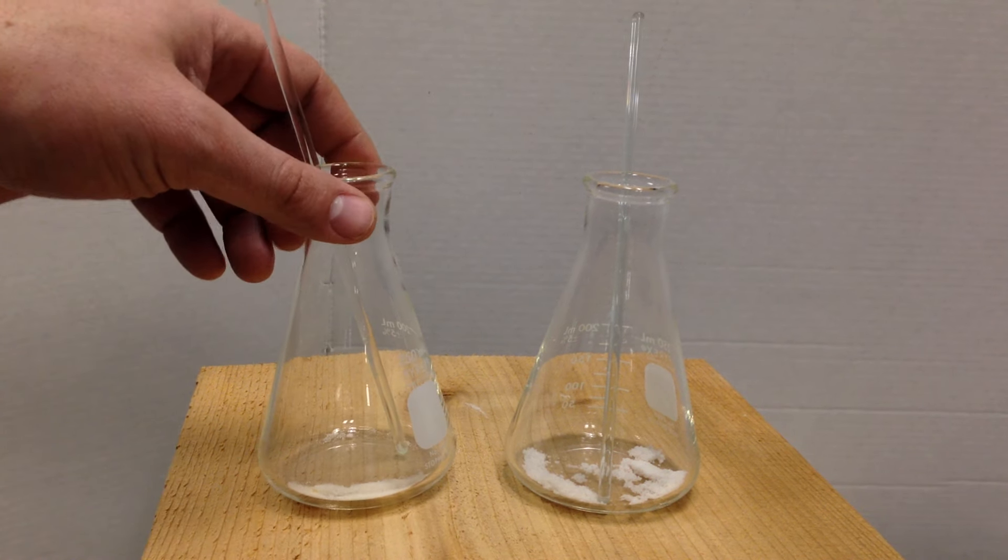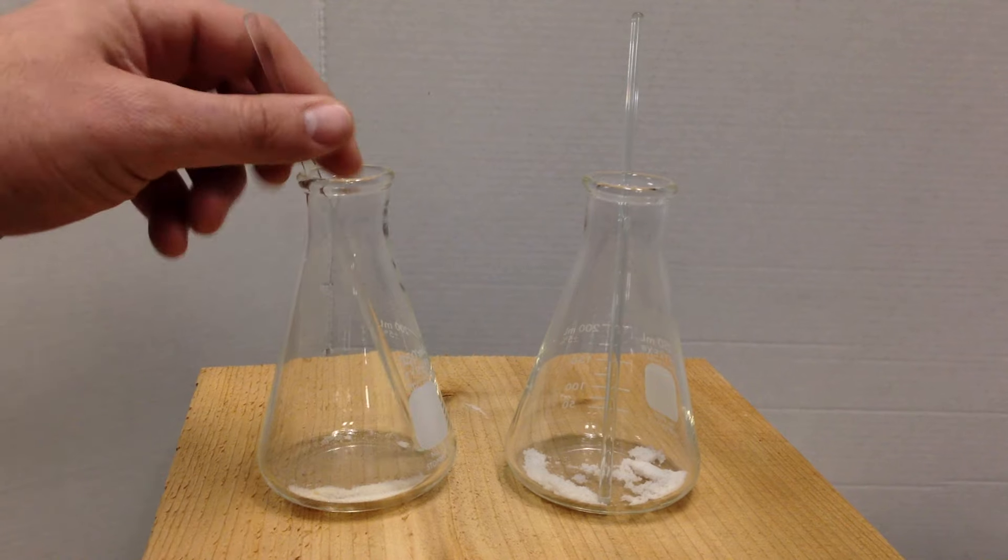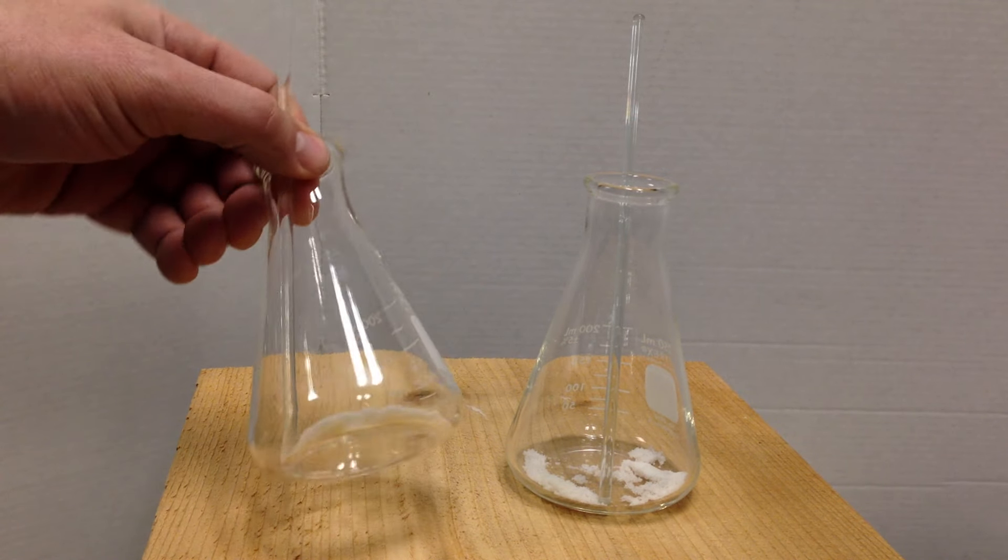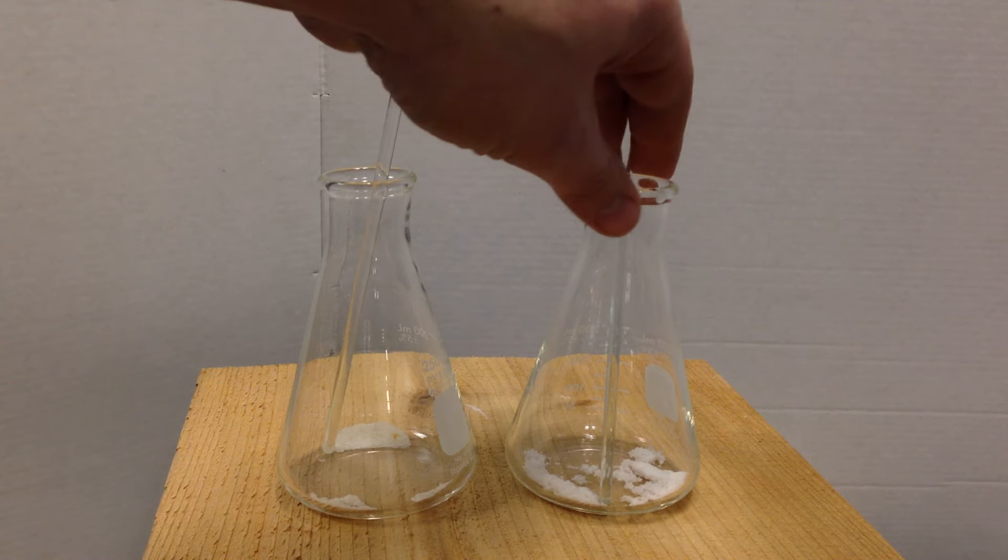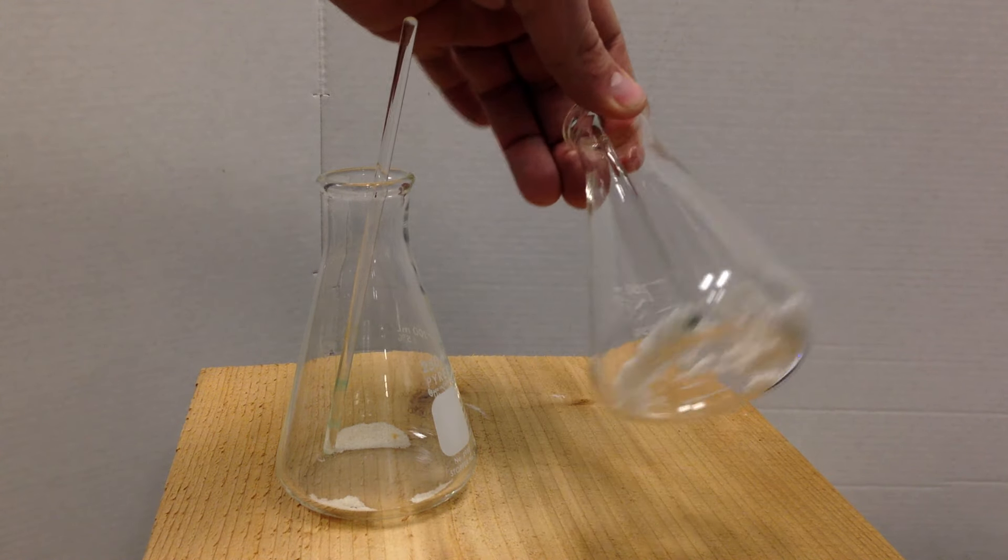What I have here is two Erlenmeyer flasks. One has lead nitrate solids in the bottom and one has potassium iodide solid or salts on the bottom.